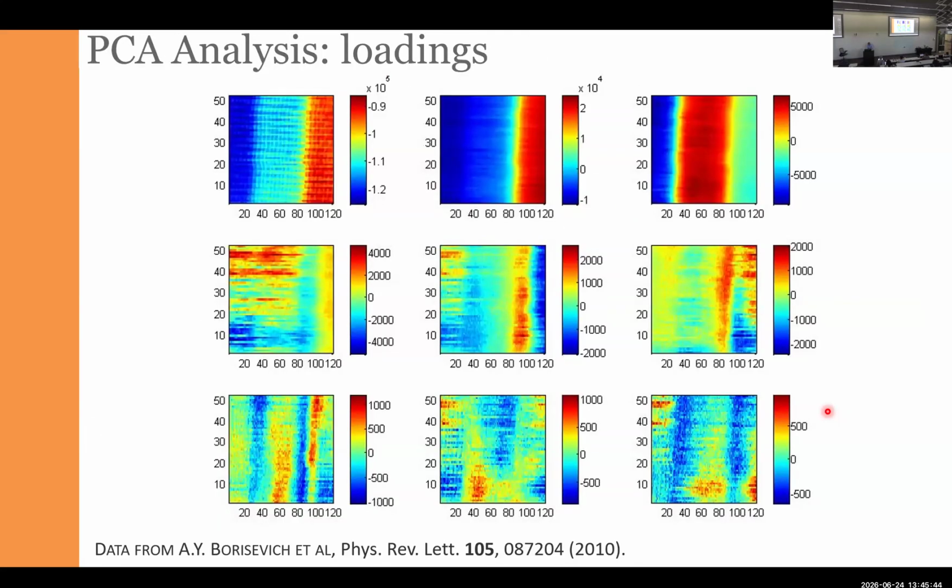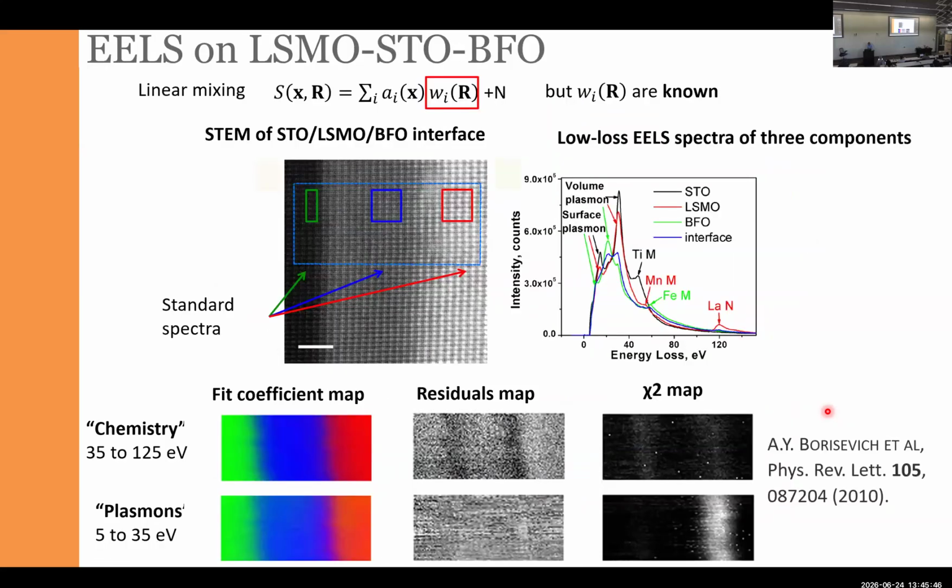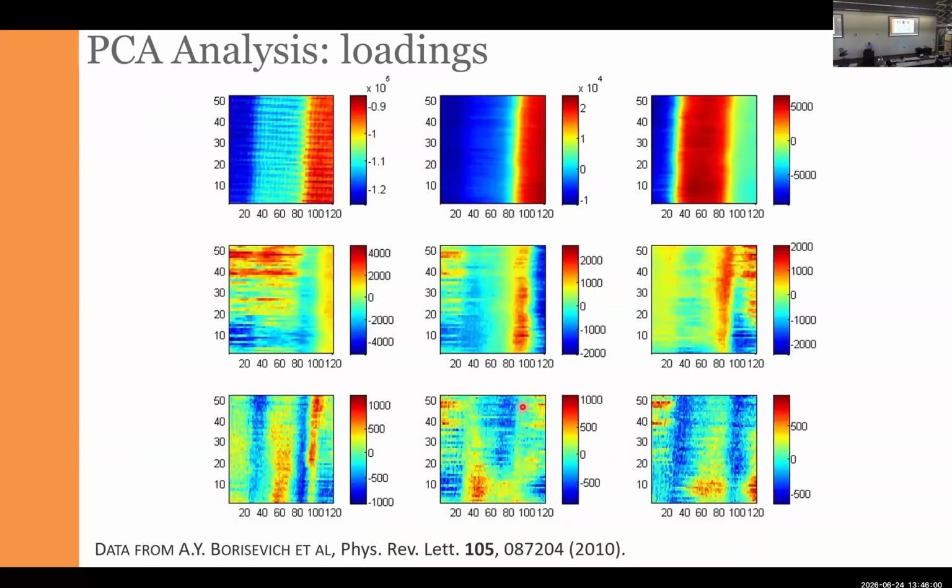So this is also the case where you can see that there is a difference between the physics and the PCA. So physical analysis gives me an answer that clearly shows that we have a linear combination of our spectra, and then we have one anomaly. If I try to run the principal component analysis, the number of components becomes very large, and figuring out which ones are correct and which ones are not becomes virtually impossible.